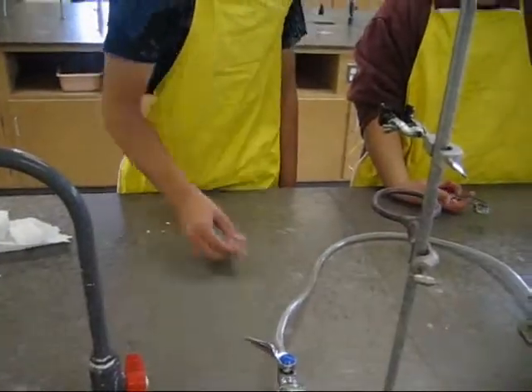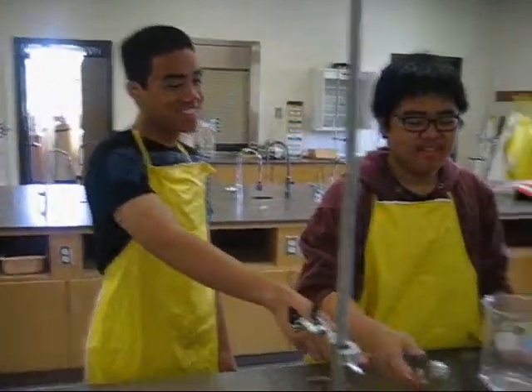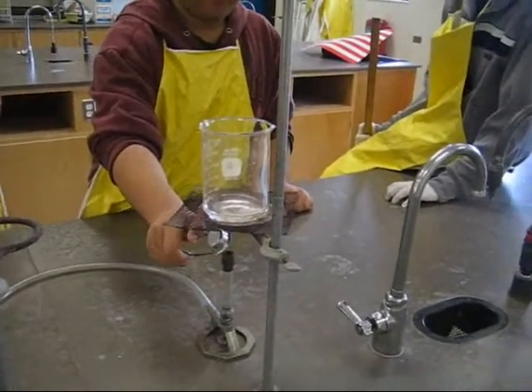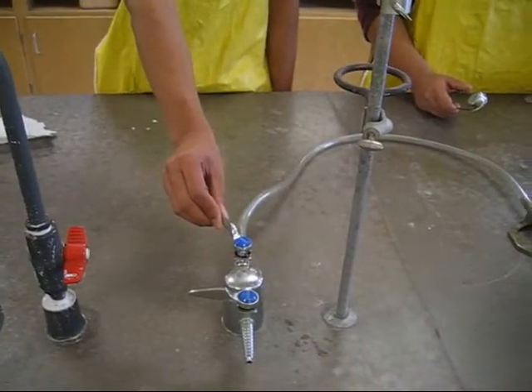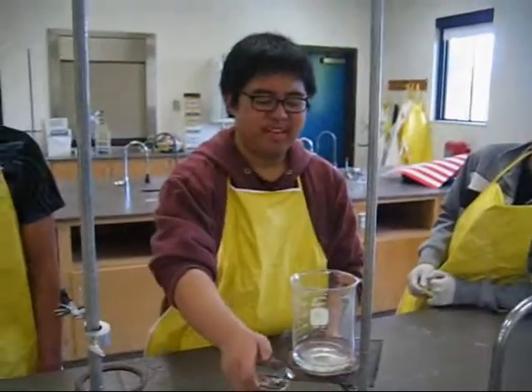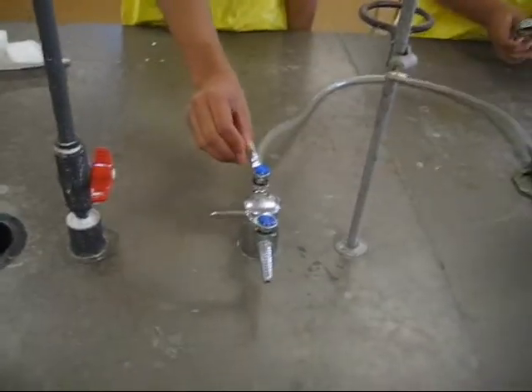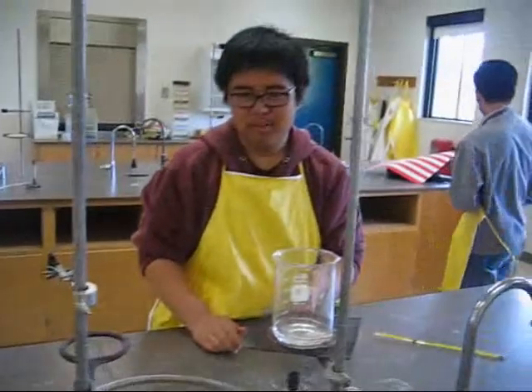Step 1. Turn on the gas. Step 2. Light up the gas.